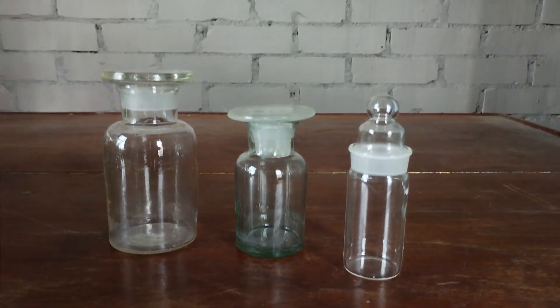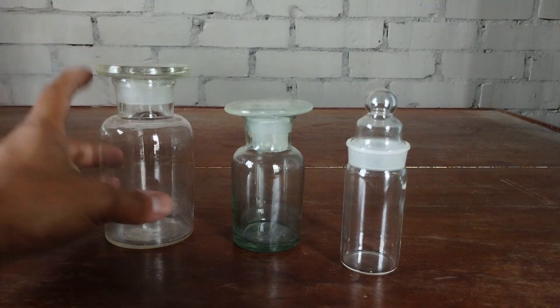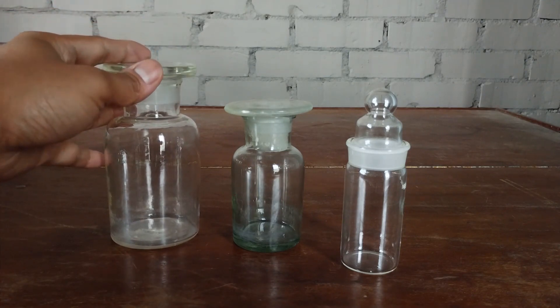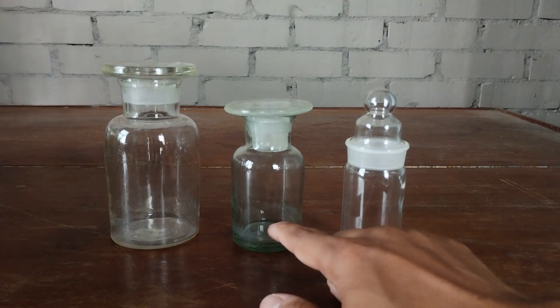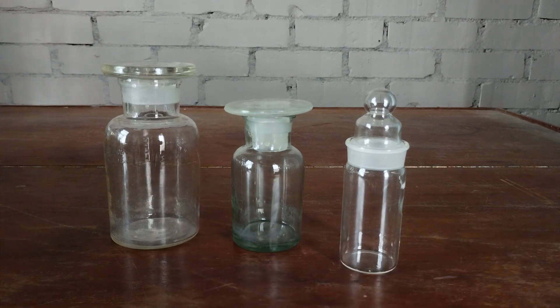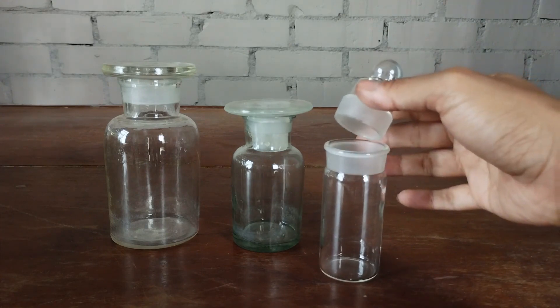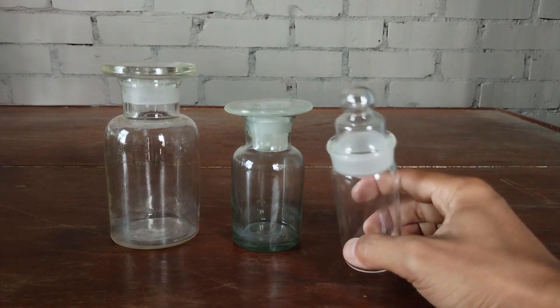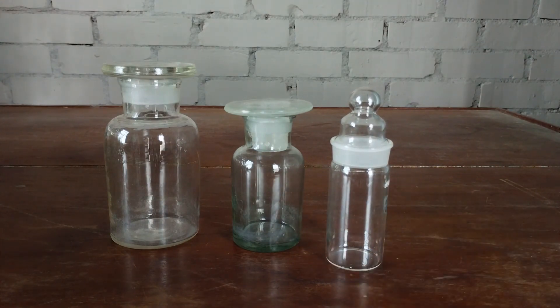Wide-mouth glass reagent bottles with tight-fitting ground glass toppers, like the ones shown here, are also commonly used as wet specimen storage containers. These types of containers are also more commonly known in certain parts of the world as apothecary jars. They come in various sizes from as small as 60 ml to as large as 2000 ml. Shown here are 60 ml, 100 ml, and 250 ml capacities. Even a weighing bottle with a ground glass topper can effectively serve the purpose of a specimen container. The bottom line is that any bottle with a good quality tight-fitting ground glass topper is a great choice for storing wet specimens.